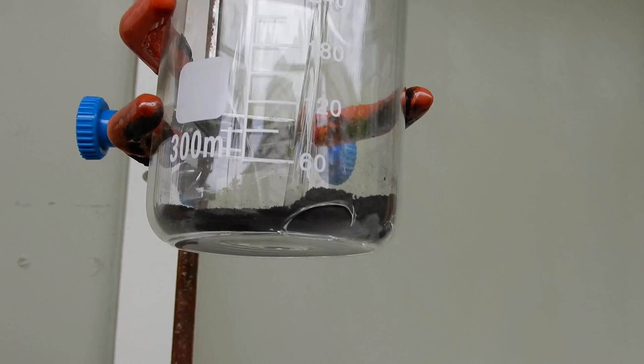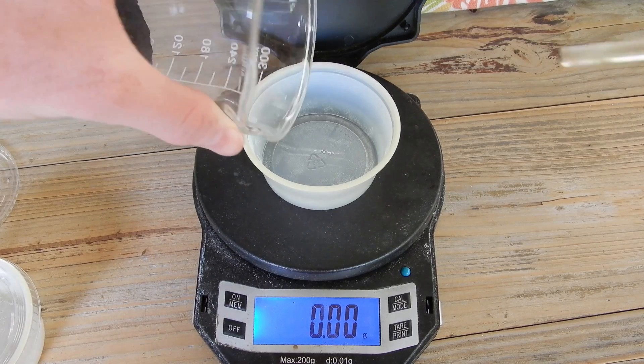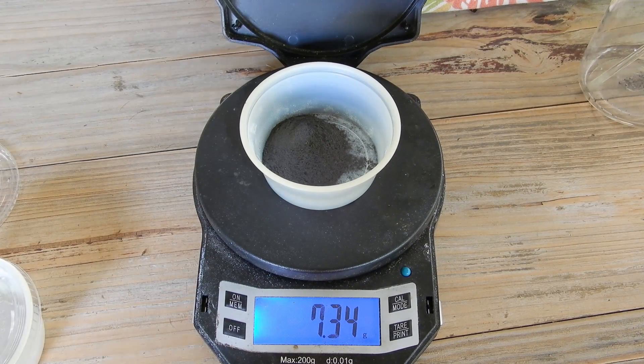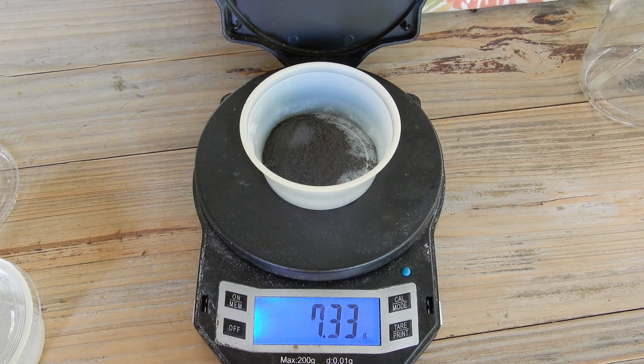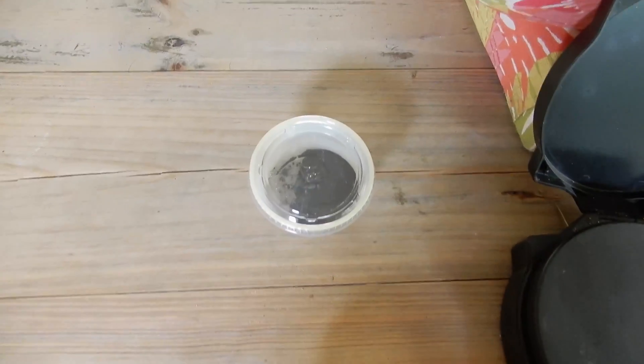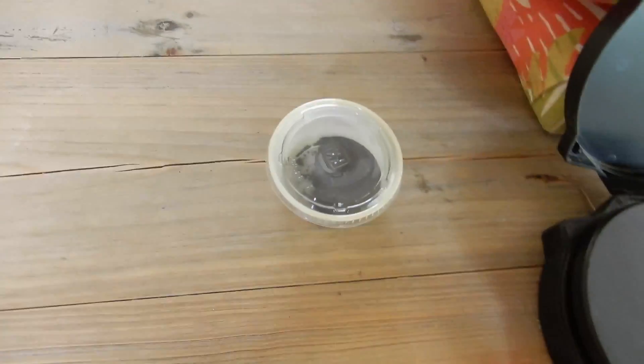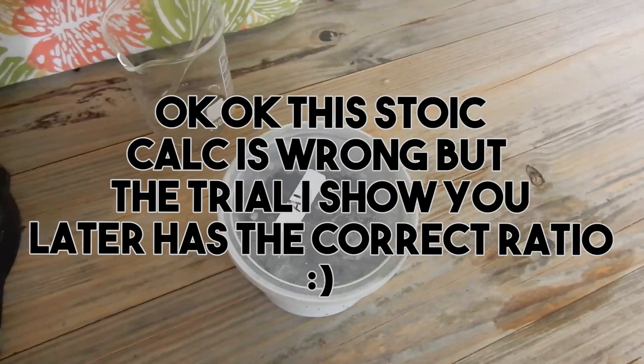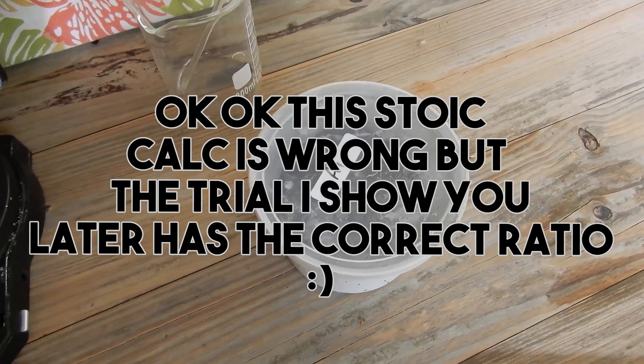Let's see the mass of the nickel oxide we collected. I'm calling it at 7.3 grams. I just did the math, and in order to form as much nickel metal as we can out of the 7.3 grams of nickel oxide, we need 1.76 grams of aluminum.